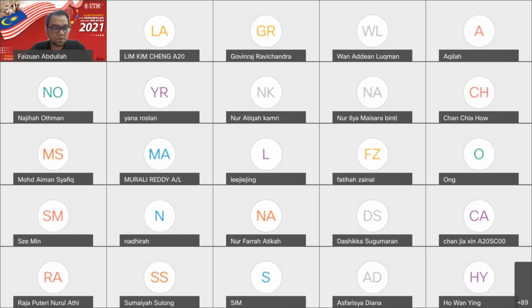The R-square value will be given on the AAS result sheet. Of course you didn't do that, this is a simulation result, but if the R-square is not a good value, lower than 0.995, you need to discuss what happened, due to some errors in preparing the calibration solution.